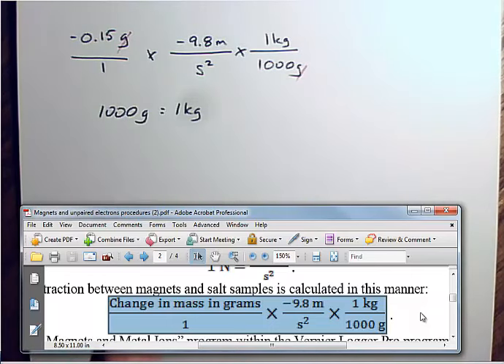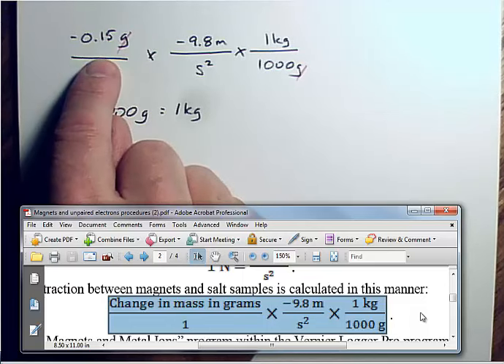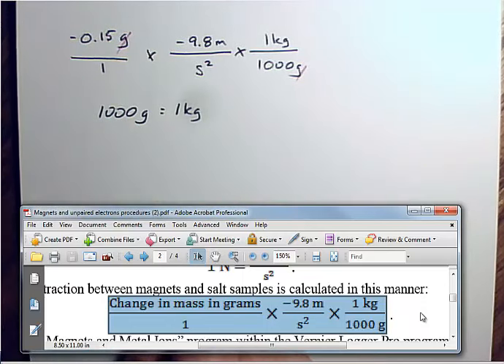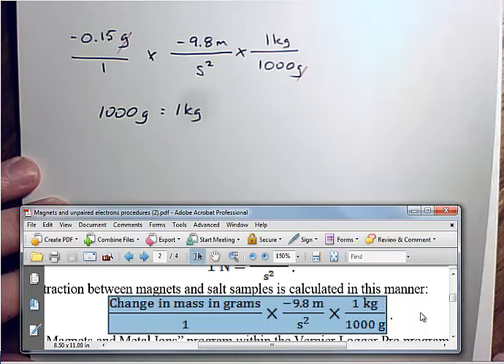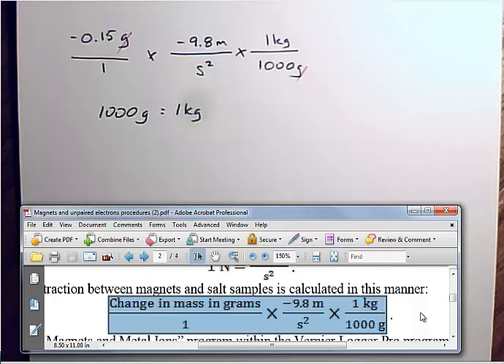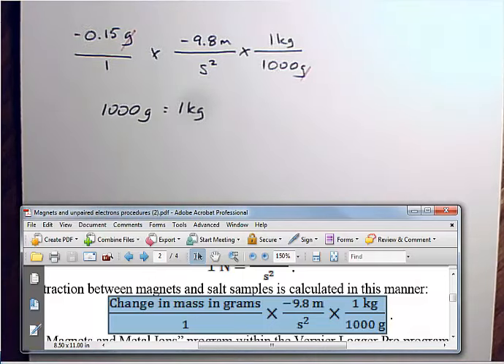But you must, listen to me carefully, you must have a sample equation for one change of mass that your group got in your lab logbook. You must have a sample equation from one of the average masses your group got in your lab logbook. Got it? This is basically, you got yours right here. Once you've got that, you're going to have 6 different changes in force.